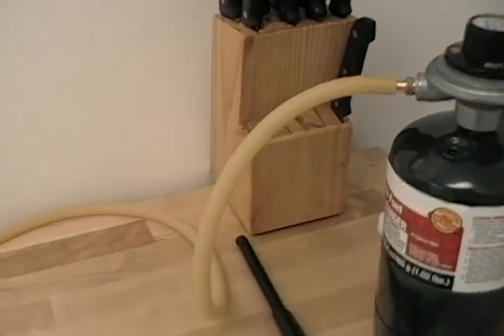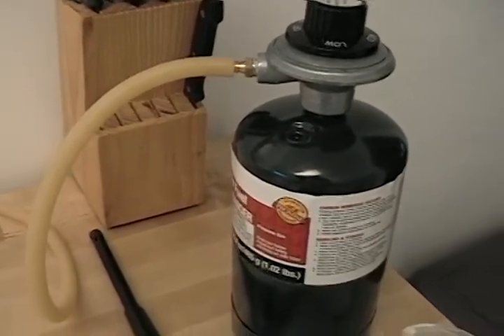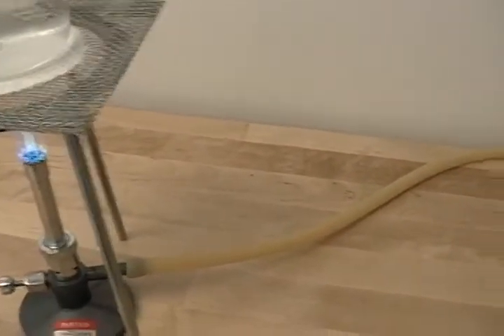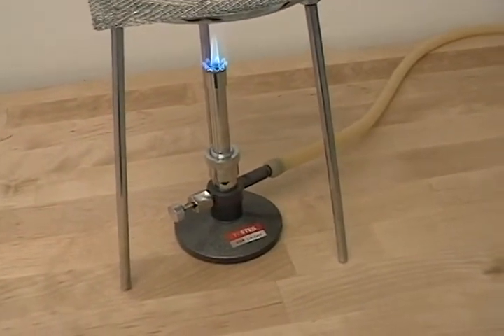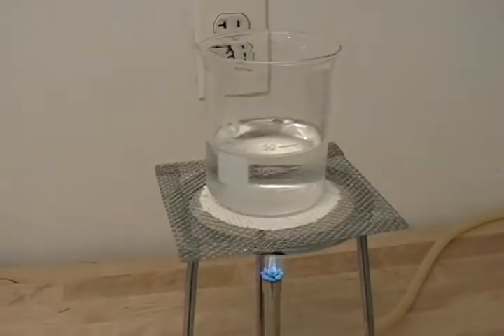For a closer look at my Bunsen burner system: I have a regular low pressure regulator on a disposable propane tank, some latex tubing, and a Bunsen burner that's rated for liquid propane. And a stand, of course. That's it.